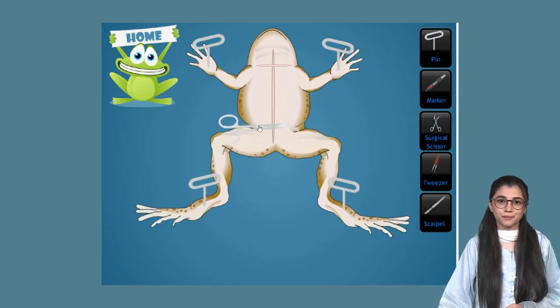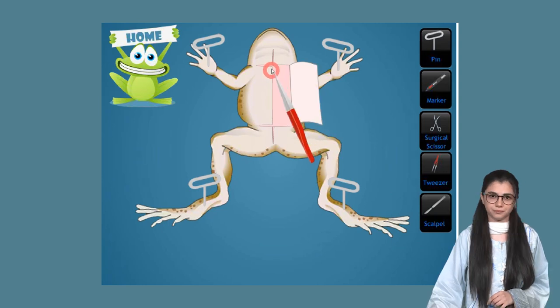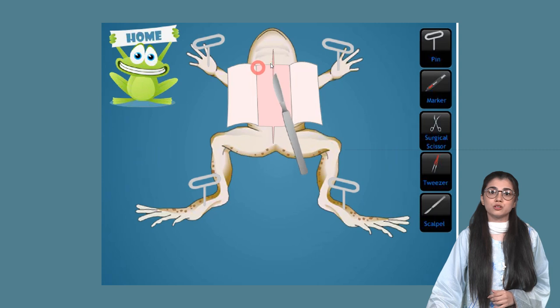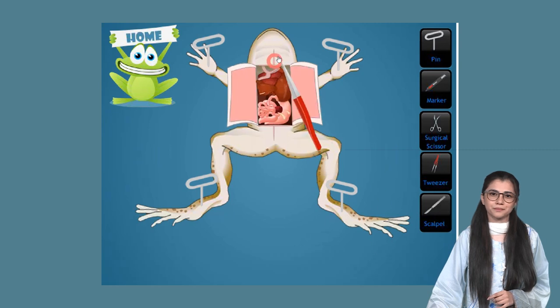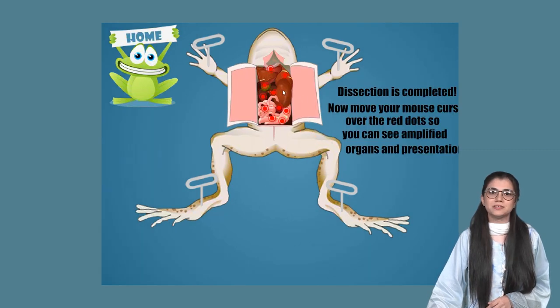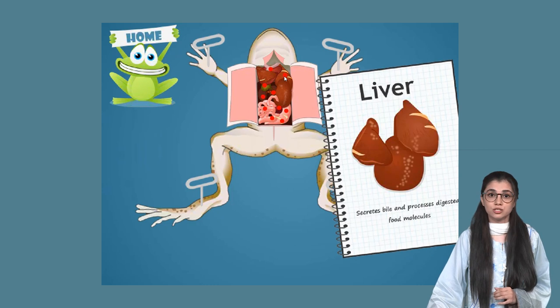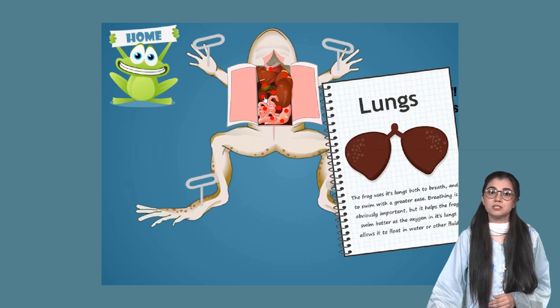Now select the tweezer. A scalpel is needed for the next step. Frogs absorb water through their skin, so they don't have to drink. Select the tweezers again. Dissection is completed. Now move your cursor over the red dots so you can see the amplified organs and view the presentation.